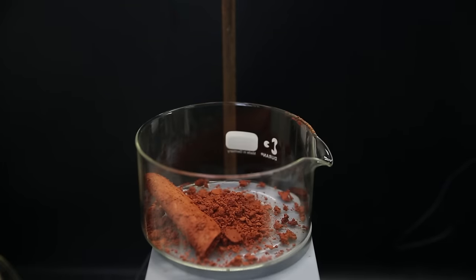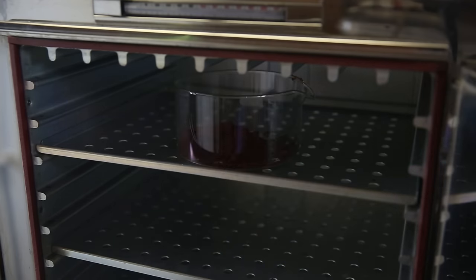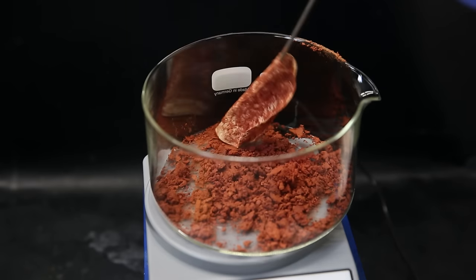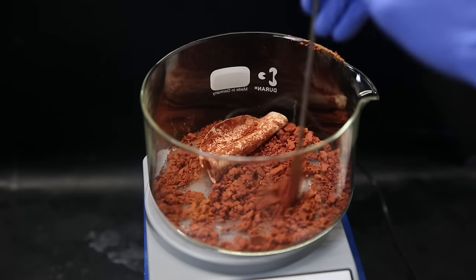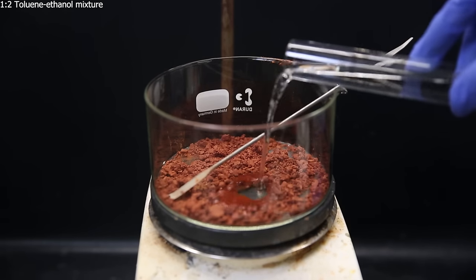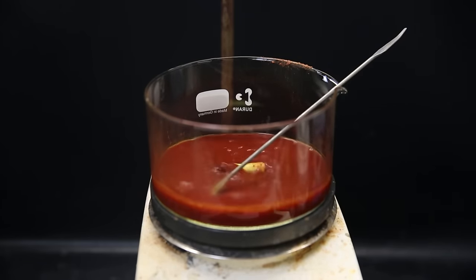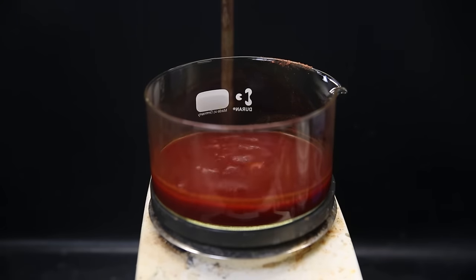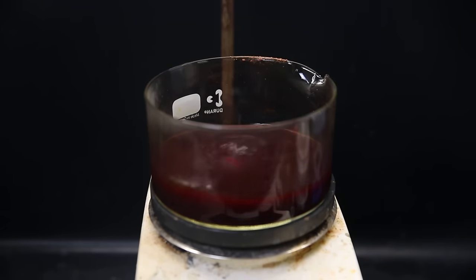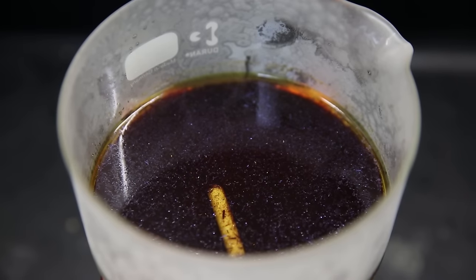Now to remove all of the remaining water, I set it in the oven until the weight is constant. When that is done, it has all dried out, and I remove the paper filter. To make sure the product is pure, I will recrystallize it. I add a 1-to-2 mixture of toluene and ethanol, and heat the mixture to a boil. I keep adding more of the solvent mixture, until it looks like everything has dissolved. After a while, that happens, and I take it off heat, and leave it to cool down to room temperature, and then put it in the freezer for a while.